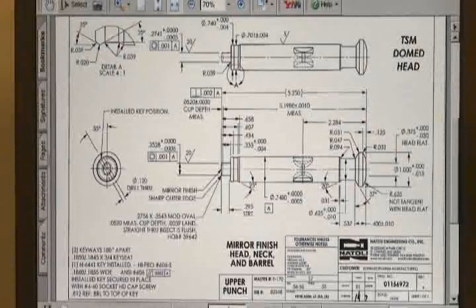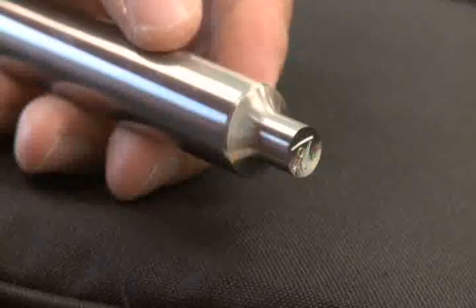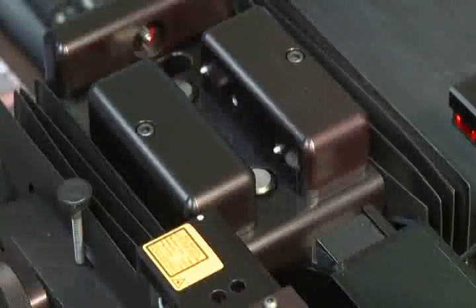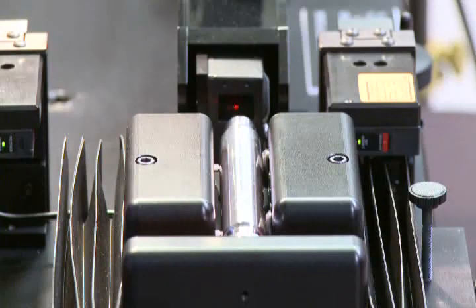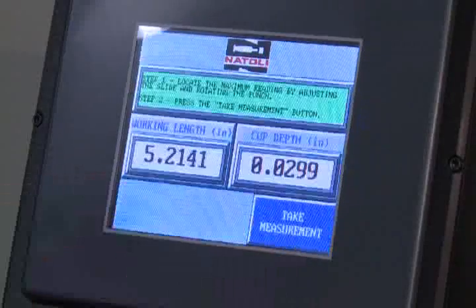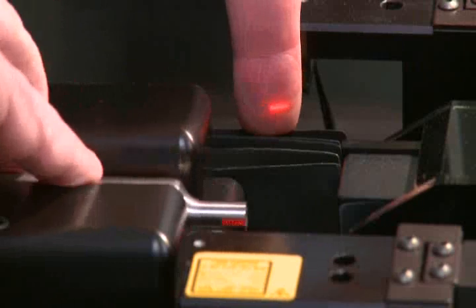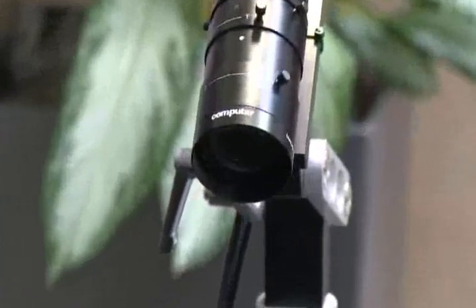With one mouse click, the customer can pull it up, view it, and print it. Your tooling information is now stored in a database, so when it comes time to inspect, the inspections are done with maximum efficiency. Place the tool in the tool nest, the tip facing the laser. The touch screen system is easy to use. The TM2 is equipped with two lasers for pinpoint accuracy and a webcam to capture photos during punch inspections.